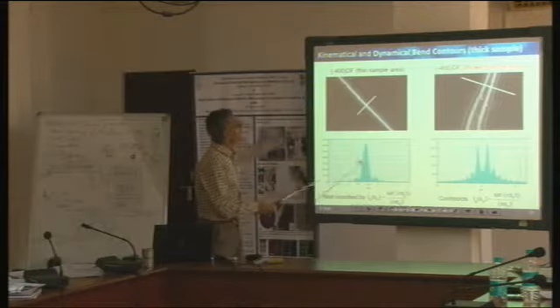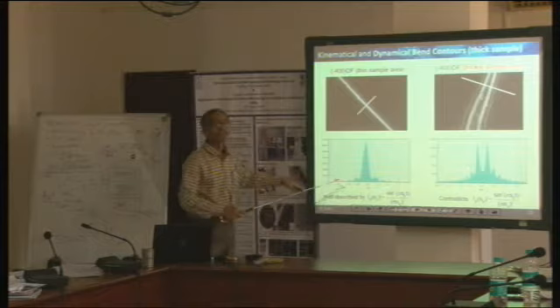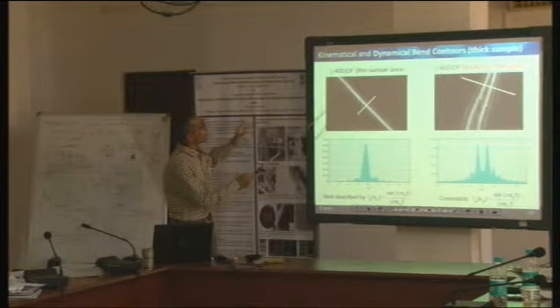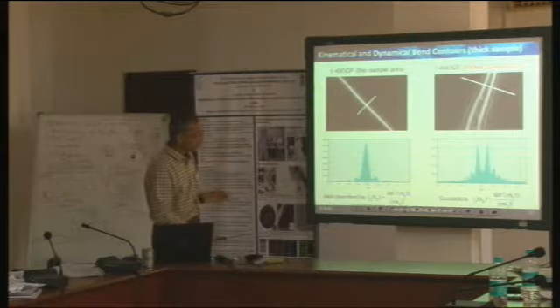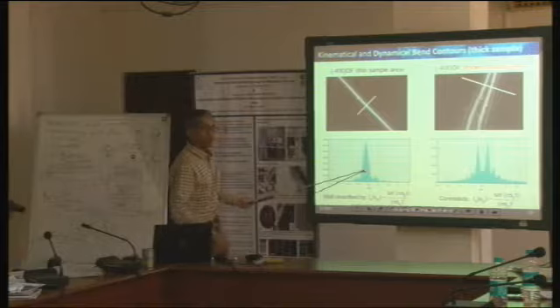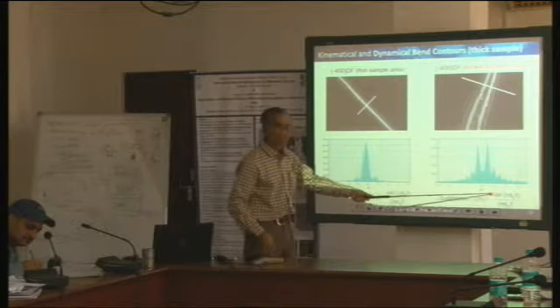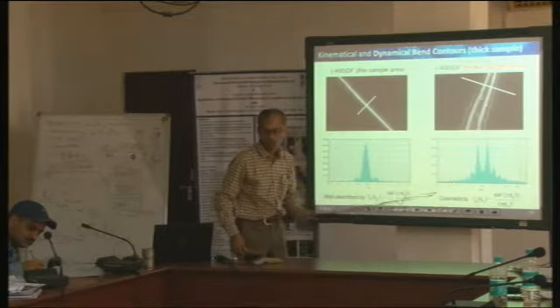So here, for a thin sample, kinematical theory works. These are called rocking curves, or bend contours, whatever, it doesn't matter. So this equation holds good here. This equation, derived considering kinematical scattering, doesn't hold good here.